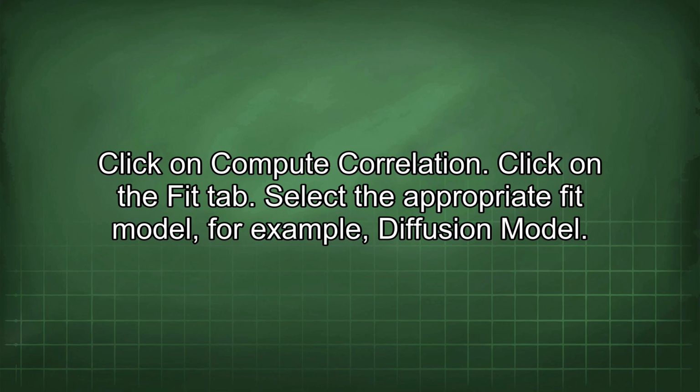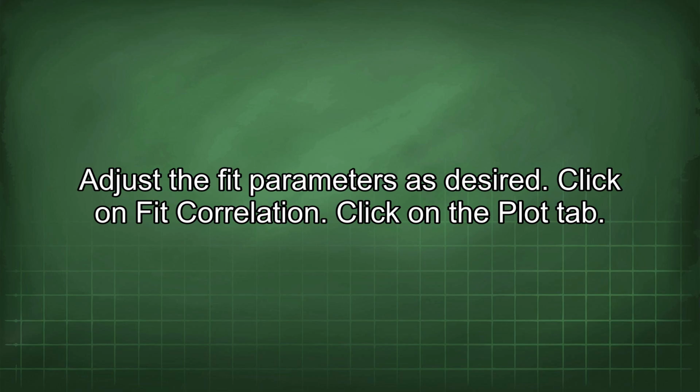Click on the Fit tab. Select the appropriate fit model, for example, diffusion model. Adjust the fit parameters as desired. Click on Fit Correlation.